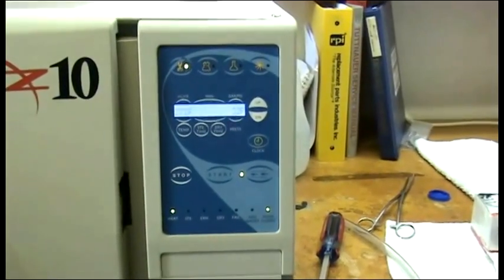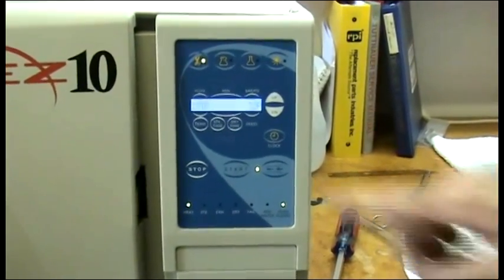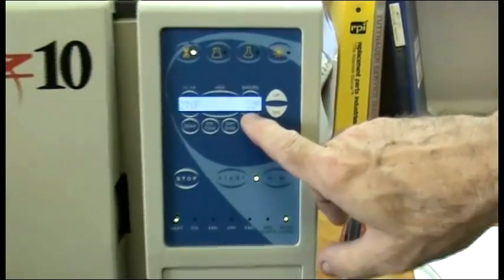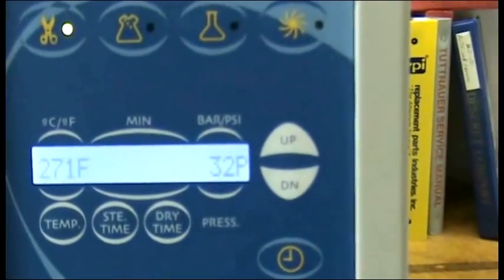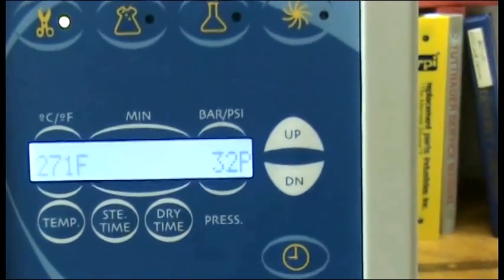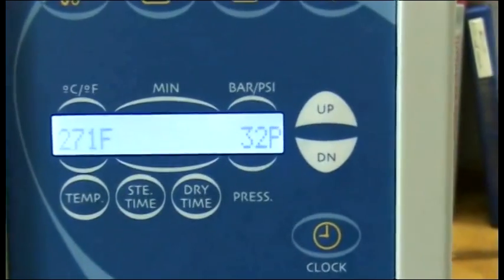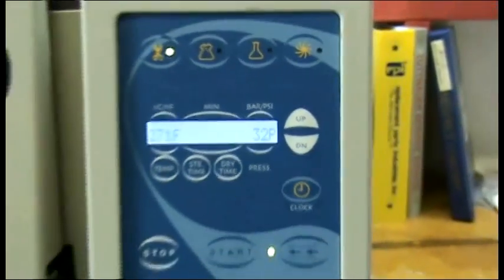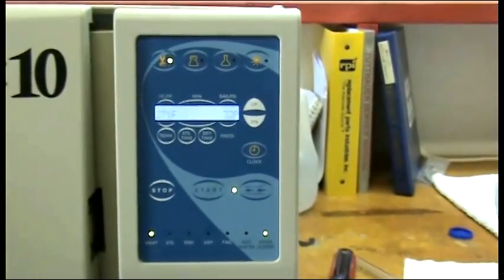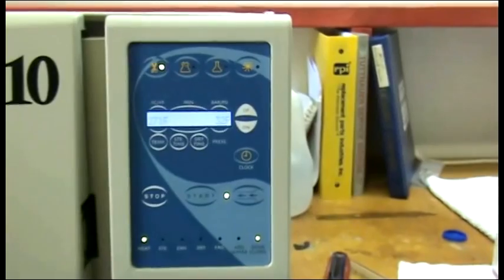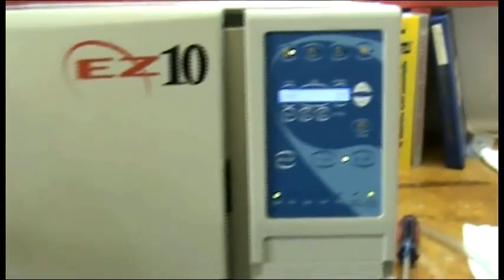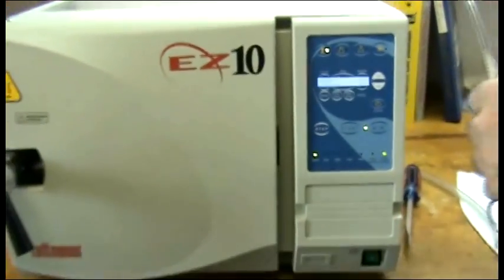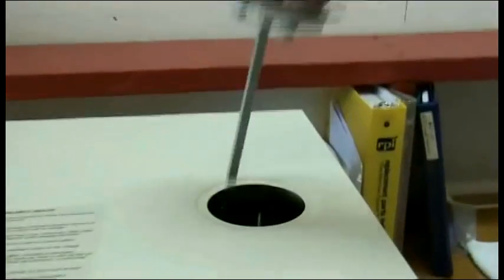During the cleaning cycle, when the pressure in the unit reaches 30 PSI or greater, now is a good time to clean the safety valve. This will release hot steam. Be very careful performing this procedure.